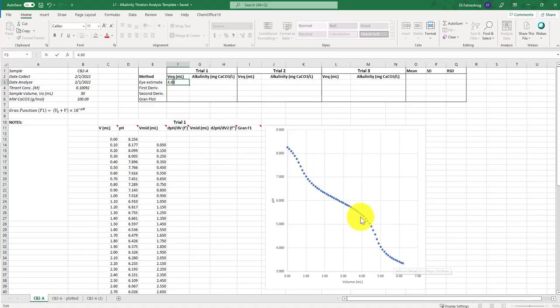This data is not captured in the most precise way because typically you want to design your titration such that the equivalence point of interest exceeds 10 milliliters to reach it. The reason for that is because if we have 10 milliliters here, notice then we've upped our significant digits, the ones we know, from 3 to 4. And so normally we're shooting for that. This example that I'm showing you only captures 3, which means it's not the ideal design for the highest degree of precision. Okay, so the next technique we want to employ is the first derivative of our titration plot.